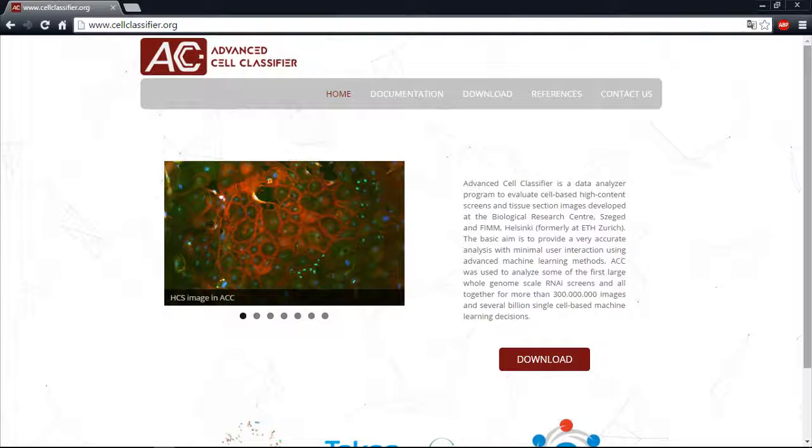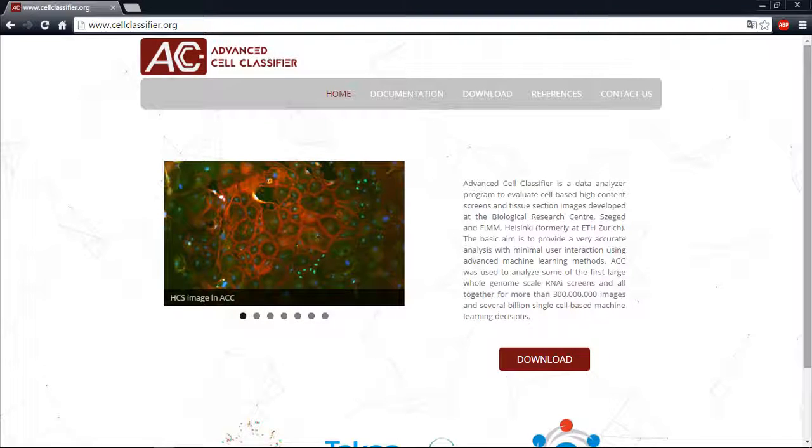Advanced Cell Classifier is a user-friendly data visualization and analysis software tool for cell-based high-content screens. The main aim of ACC is to provide accurate phenotypic analysis using advanced machine learning methods with minimal user interaction.